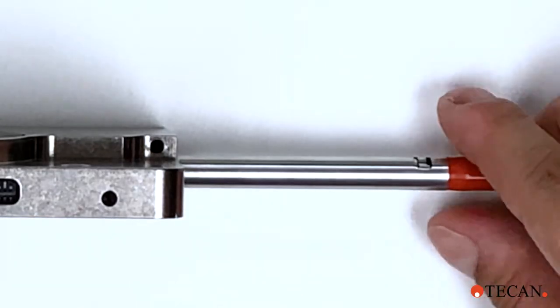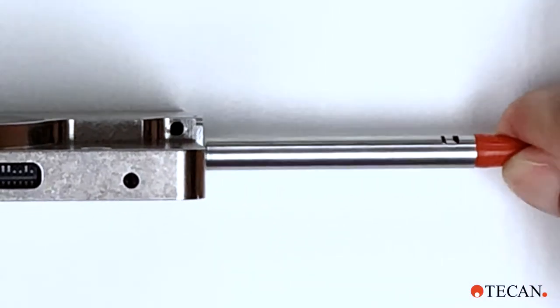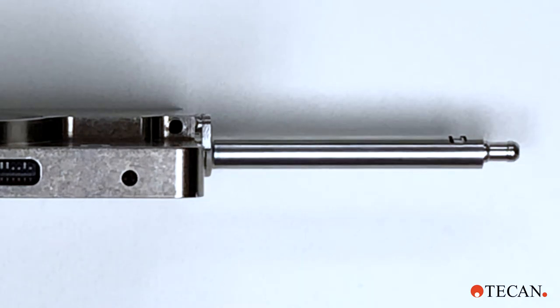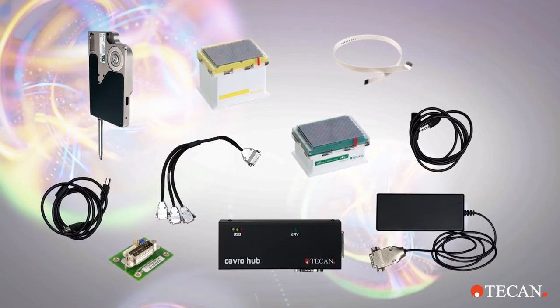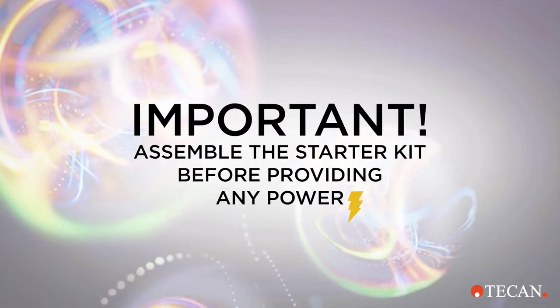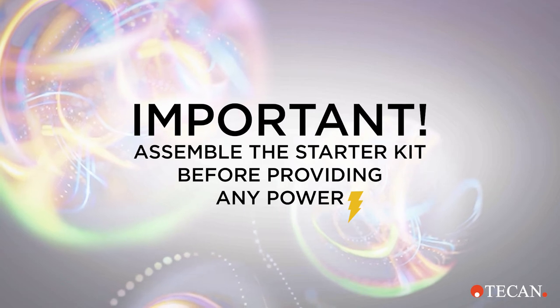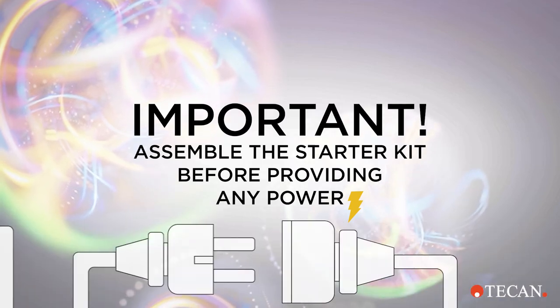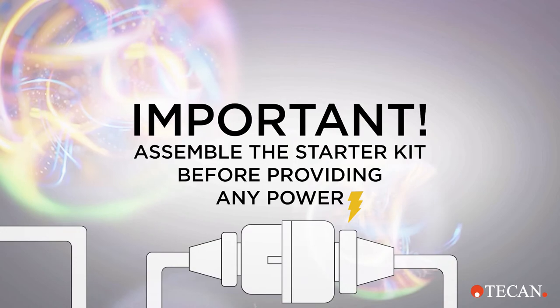Remove the red cap from the tip of the ADP probe. This cap protects the tip during shipping. Note the ADP will not initialize if the cap is in place. Now let's assemble your ADP starter kit. It's important to fully assemble the starter kit before providing it any power. So we will save plugging the power supply into the wall for the last step.